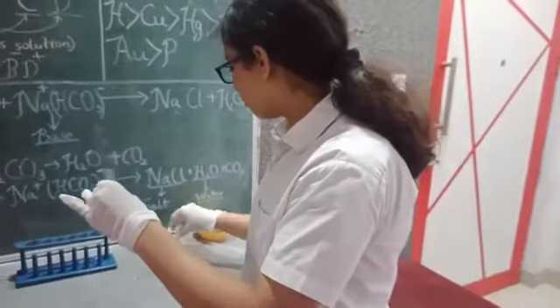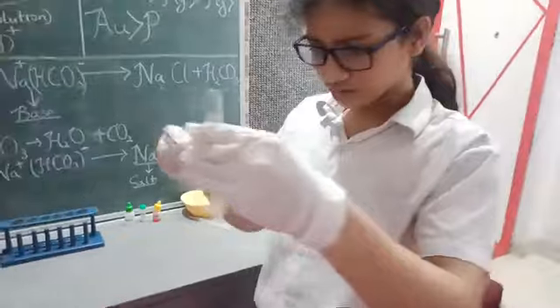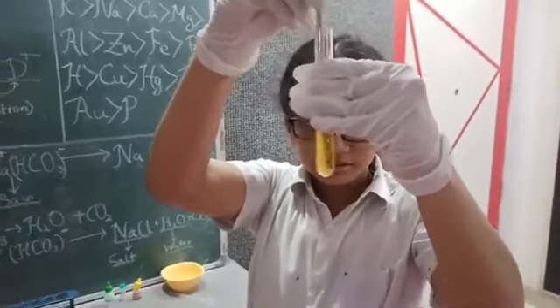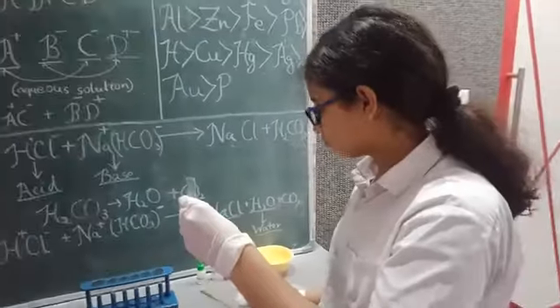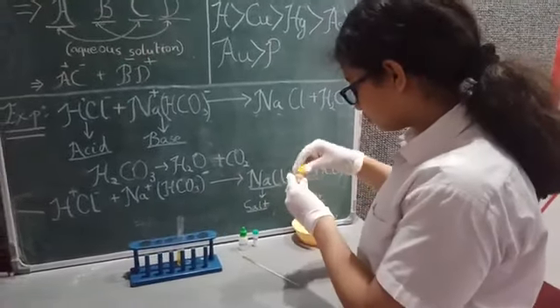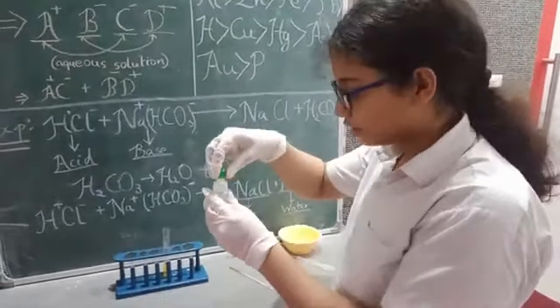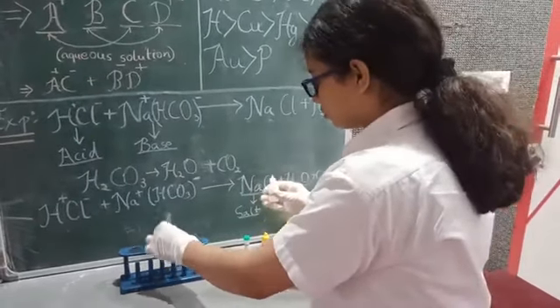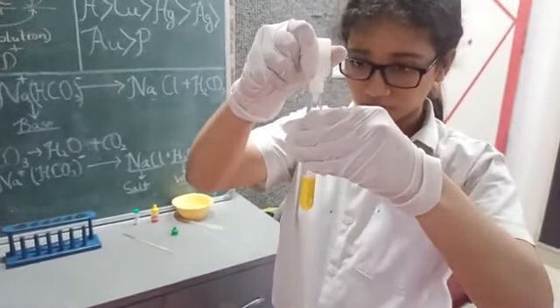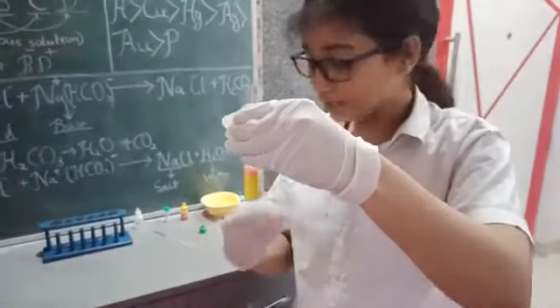As we know from my earlier video, whenever methyl orange comes in contact with anything basic, it forms a yellowish orange color, which you can see. Now slowly I will start adding drops of hydrochloric acid to the solution. Wow, look, it's getting a bit orangish in color, right?